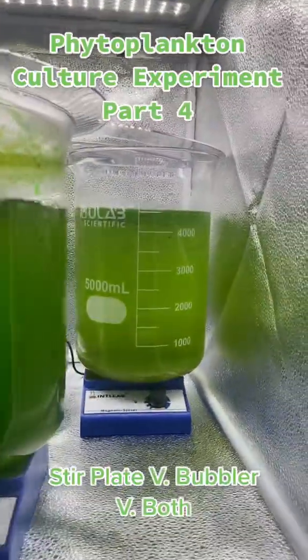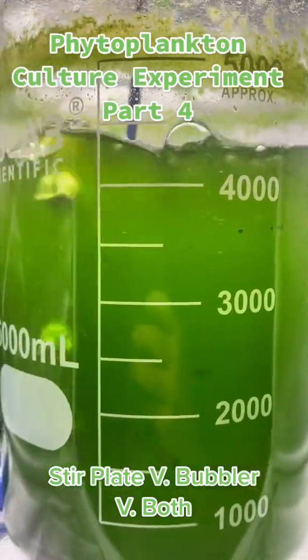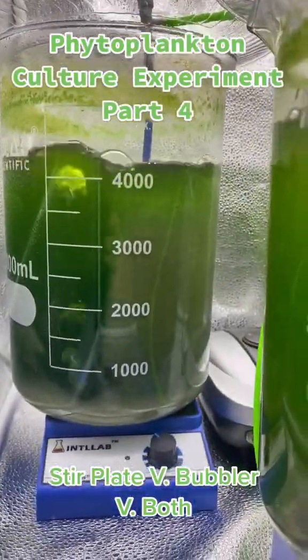Hey all, this is Bob, aka Mr. Reefsafe. This is Day 7 of the Phytoplankton Culture Experiment, Part 4. Today we're looking at the stir plate versus bubbler versus both.